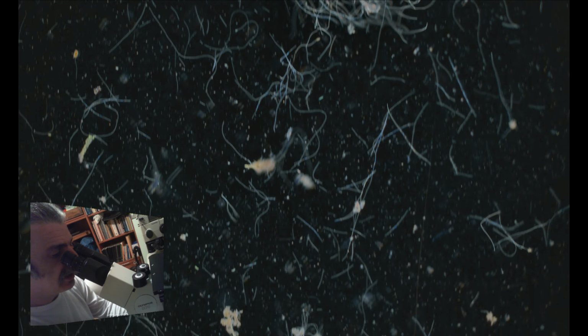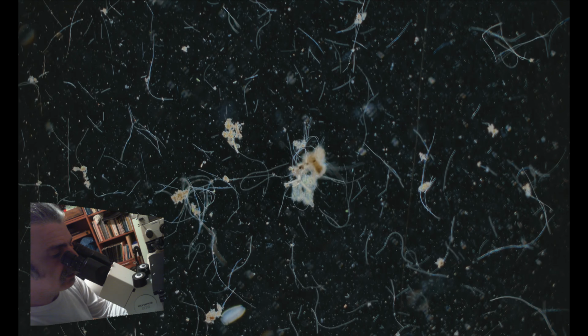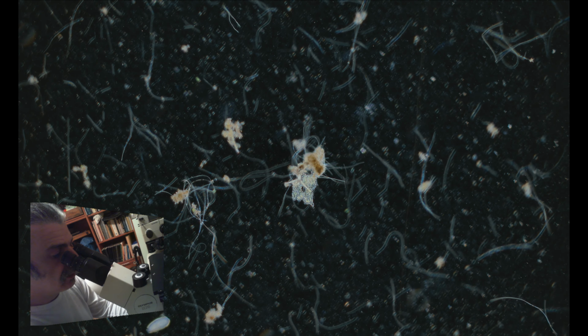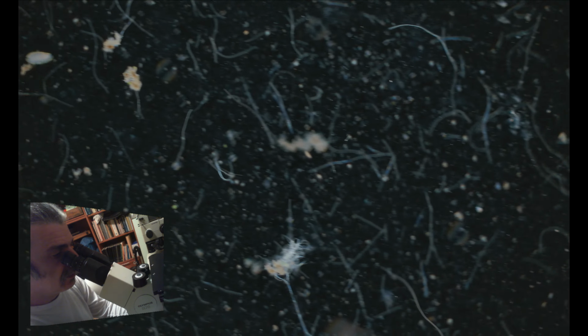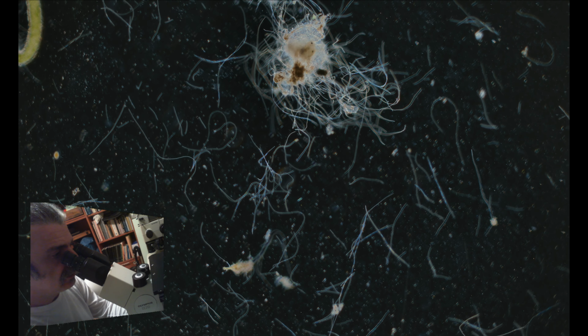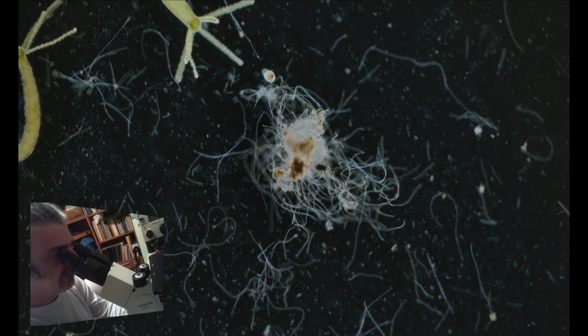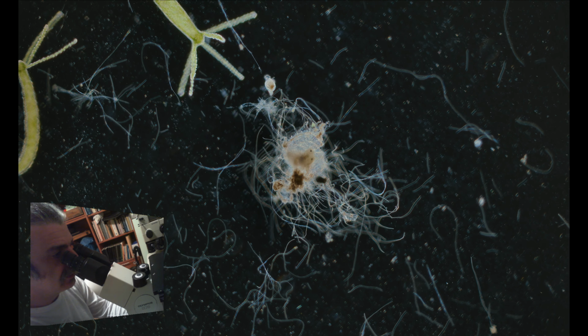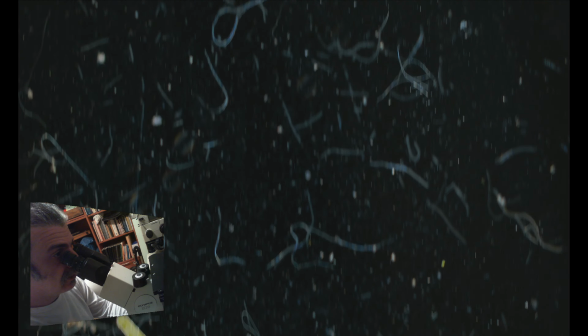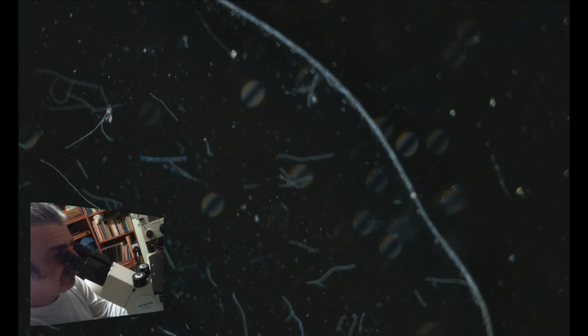I'm using now an illumination technique called dark field, which gives us a very nice contrast of the water and the microbes within it. So let's start methodically scanning from right to left and see which creatures we identify first, the big ones.